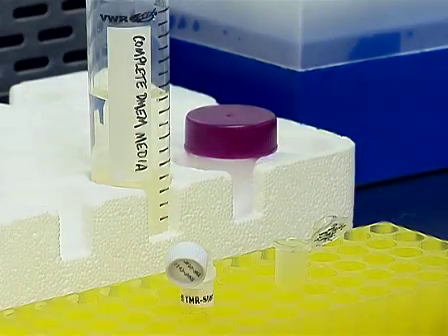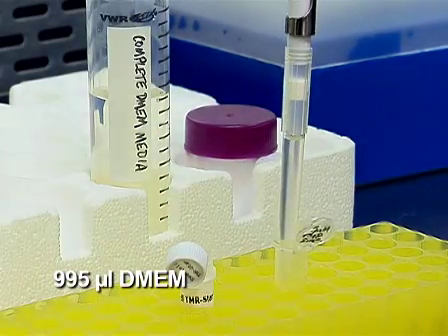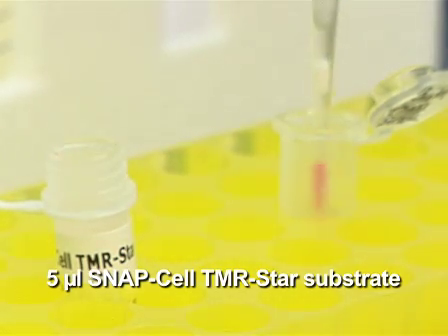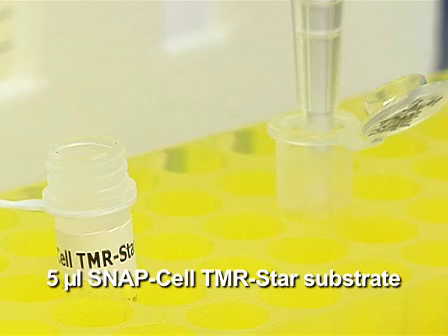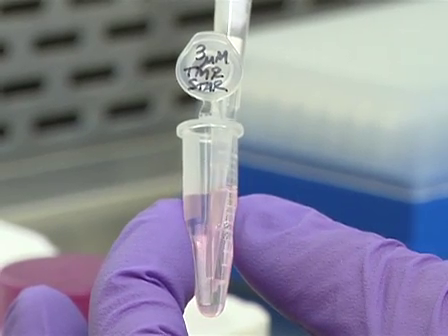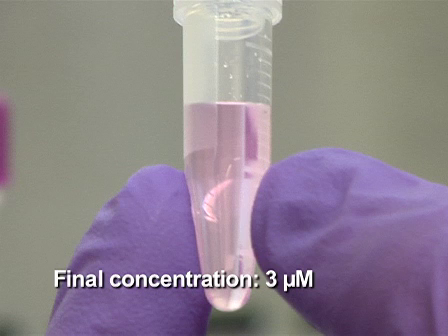Mix dilabeling media by adding 995 microliters of complete DMEM and 5 microliters of 0.6 millimolar SNAPCELL TMR-star substrate. Pipet up and down several times to mix after the addition of substrate. The final concentration of SNAPCELL TMR-star should be 3 micromolar.